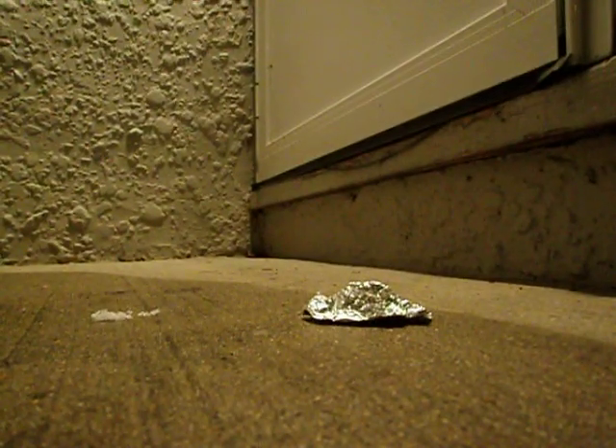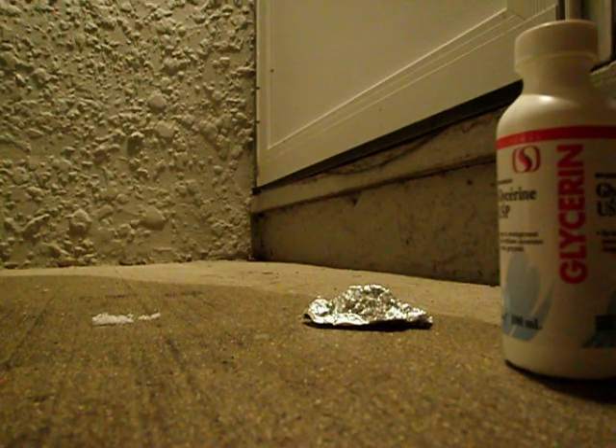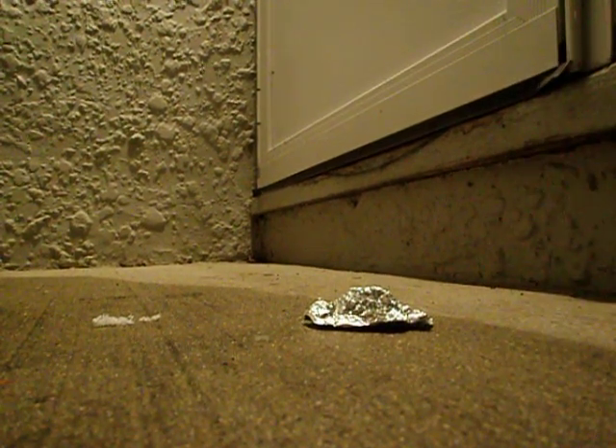Alright, we're going to mix. I've got some potassium permanganate with a bit of magnesium in it here, and I'm going to add some glycerin. I'm just going to pour it into the tin foil before I pour it directly into there, because I don't know how fast it's going to react.